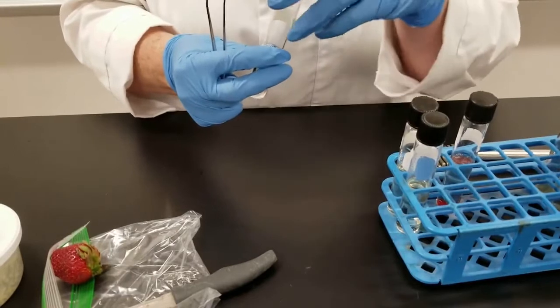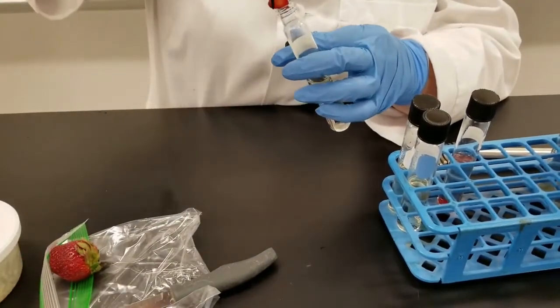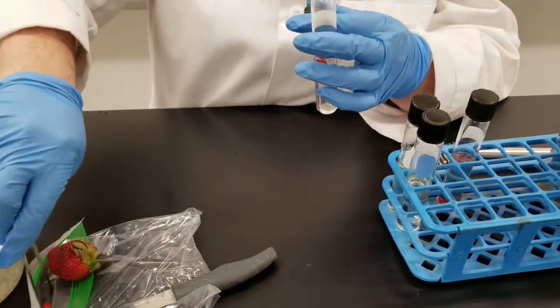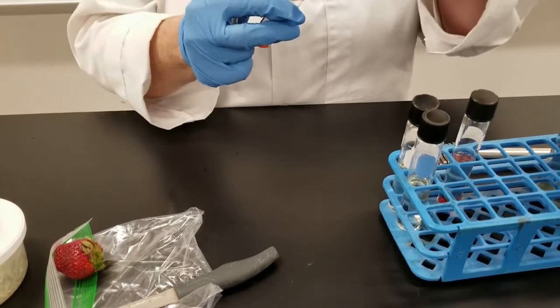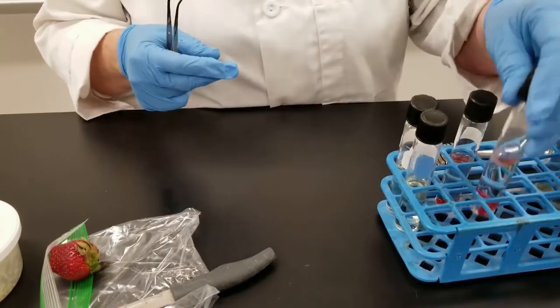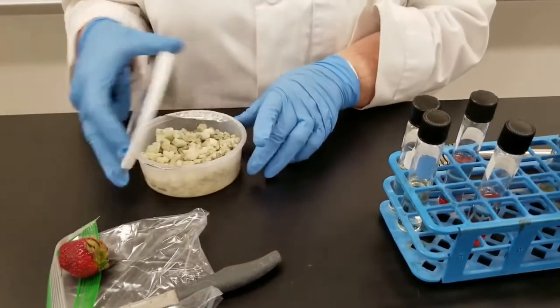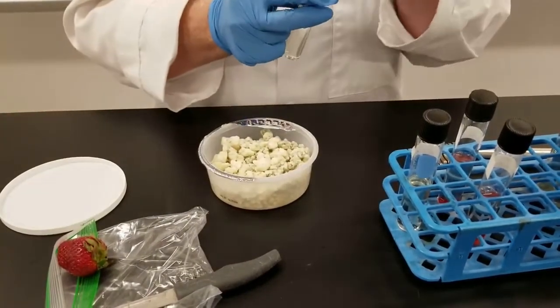We're going to grow this for 24 hours. I'm picking strawberries because strawberries are notorious for having fungal spores on the outer surface of them. Everybody's familiar with that when you see those beautiful strawberries at the grocery store, and then you come home and the next day, oh, I want strawberries, and they have all the little fuzzies on them.